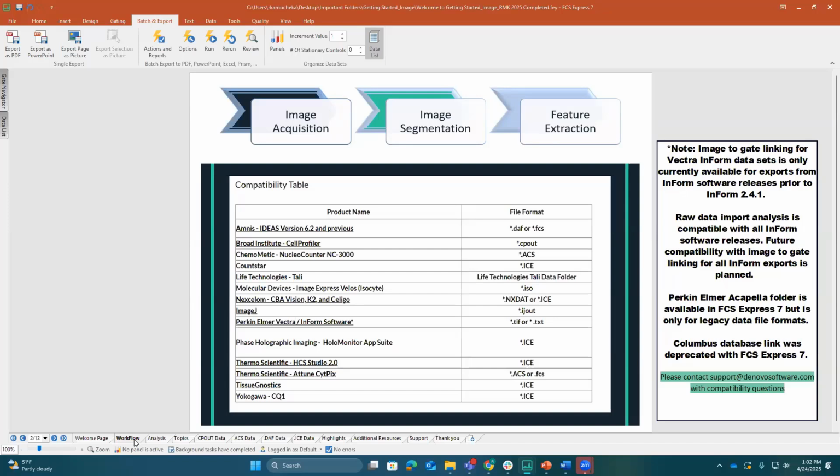After we've done that part, we can take those distinct objects and we get to extract features that provide additional information such as light intensities, shapes, sizes, and other identifying properties that can be used as parameters. FCS Express can handle as many features or parameters as your third-party software can provide. For segmentation, there are both free and paid-for varieties, and we can read from a variety of different file types from the image cytometer as well as from these segmentation tools.